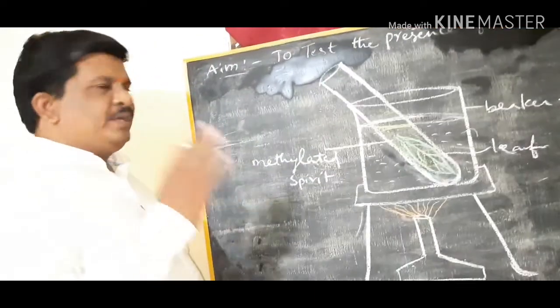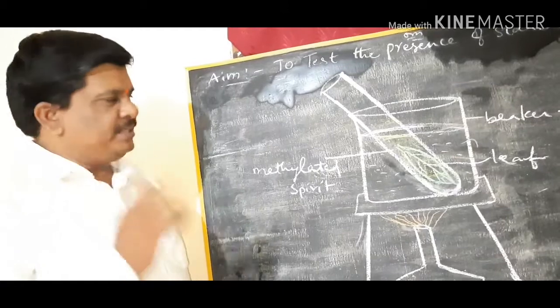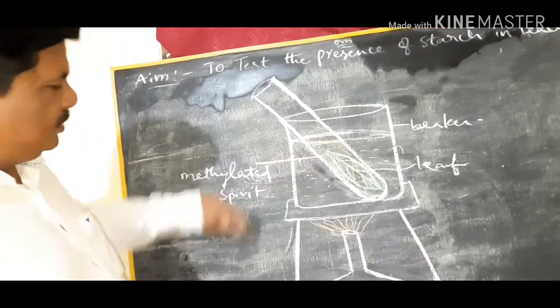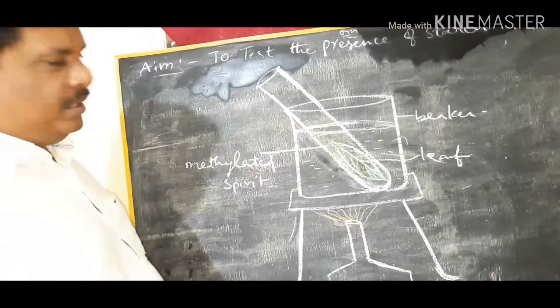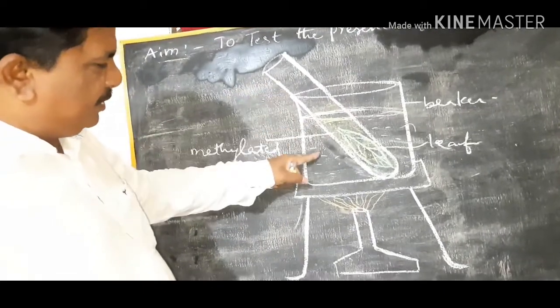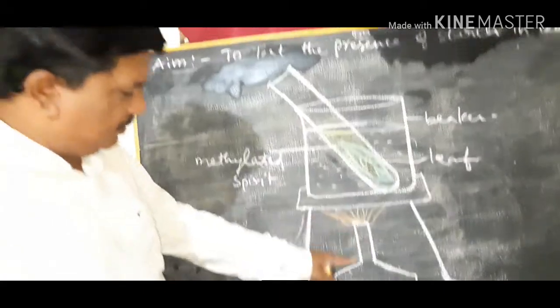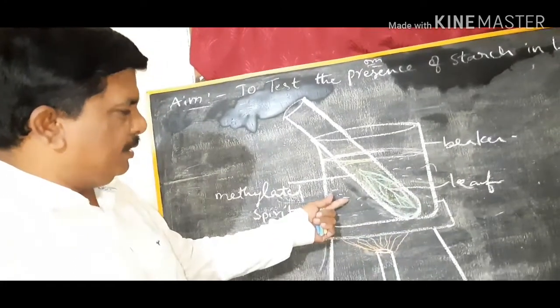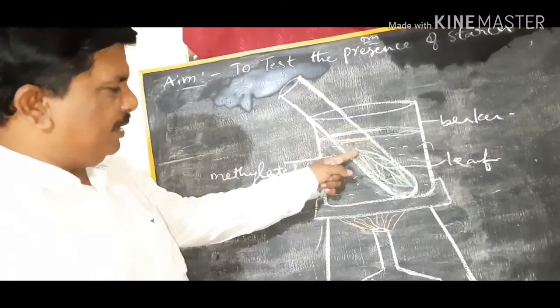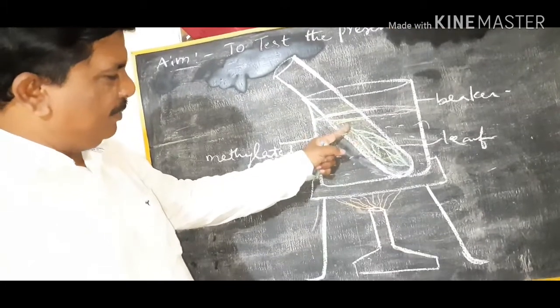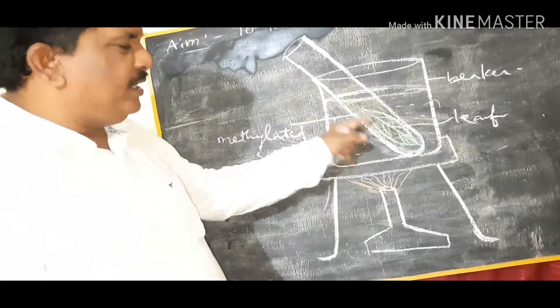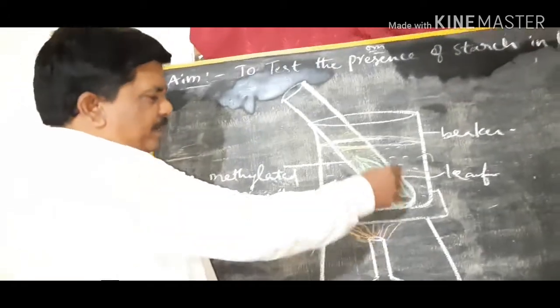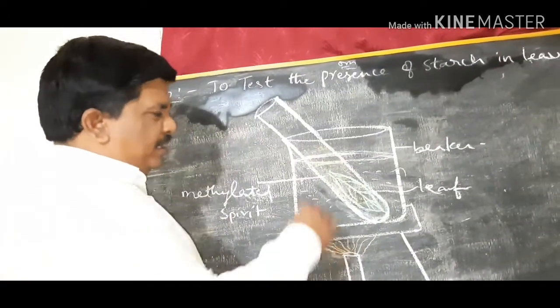Once again, we place the leaf in the test tube which contains methylated spirit. We keep this test tube in the beaker which contains water. Due to this boiling, the water gets boiled, the test tube gets boiled, and the alcohol gets boiled. Immediately, the boiled alcohol bleaches the color of the leaf and it turns pale.